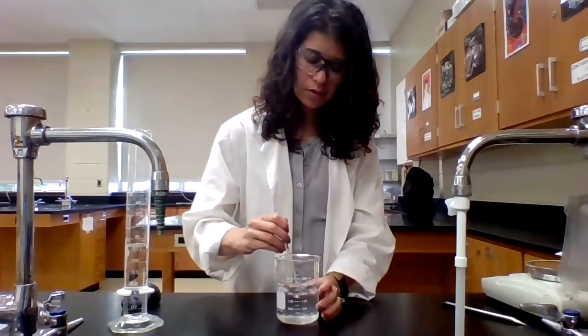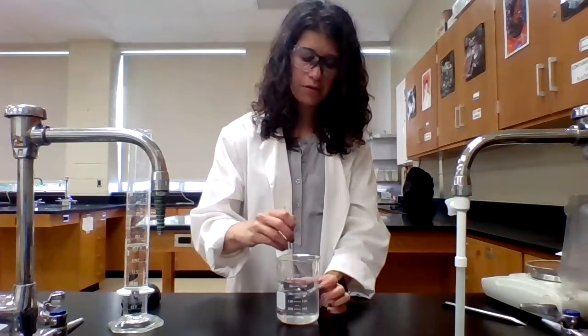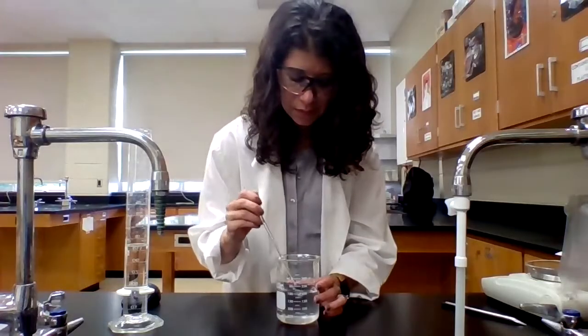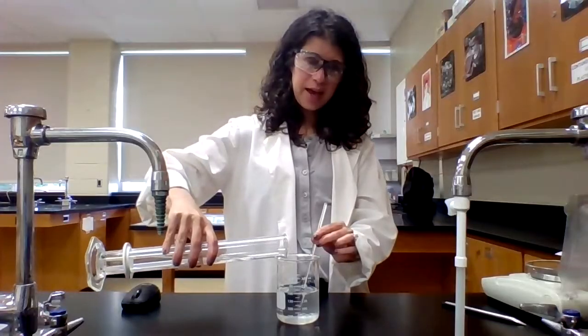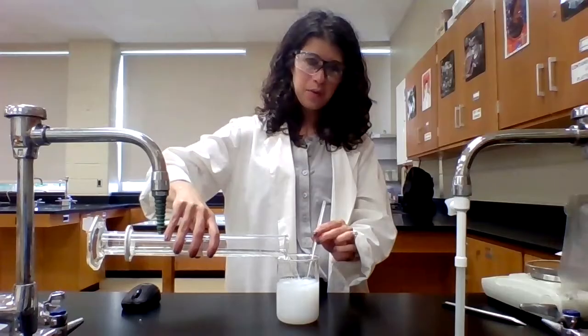Give this one again, just make sure all of that group 1 has dissolved. That looks pretty good. And so once I add this calcium chloride, we're going to see a milky white precipitate form. And that's our product. That's the calcium carbonate that is not soluble in water. Calcium carbonate is chalk. So if you've ever tried to dissolve chalk in water, it doesn't work. It's not soluble. So as soon as I add even a little bit, you can see that milky white solid form.